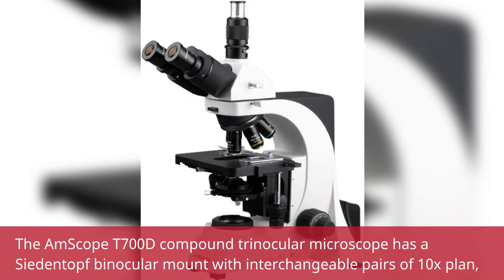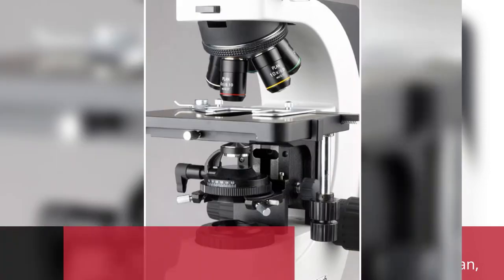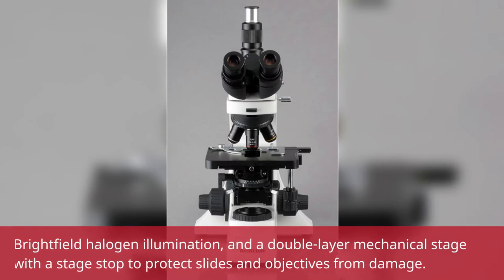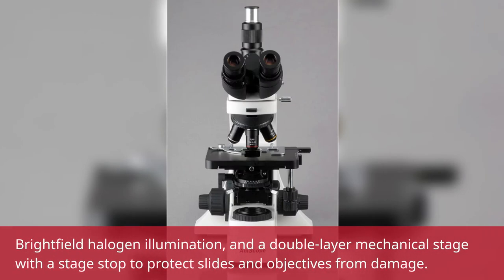The M-Scope T700D Compound Trinocular Microscope has a ZDIN Topf Binocular Mount with interchangeable pairs of 10X Plan, 20X Super Widefield, and 25X Super Widefield Eyepieces, a Reverse Mounted Quintuple Nosepiece with 5 Infinity Plan Objectives, Brightfield Halogen Illumination, and a Double Layer Mechanical Stage with a Stage Stop to protect slides and objectives.